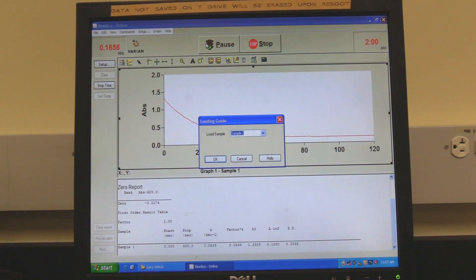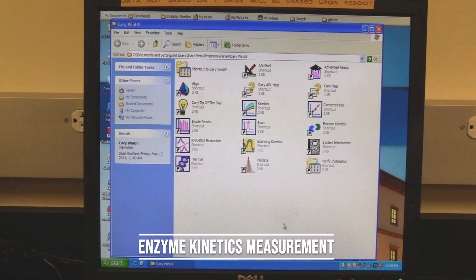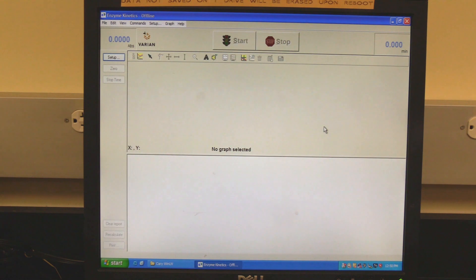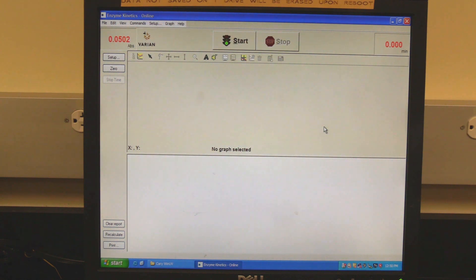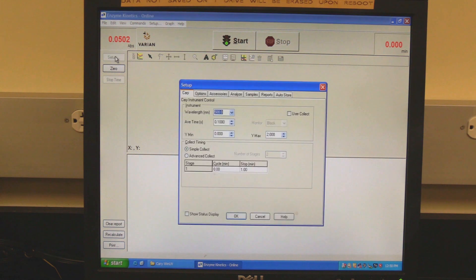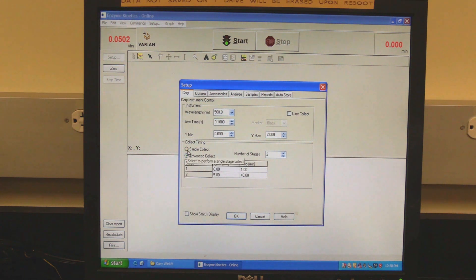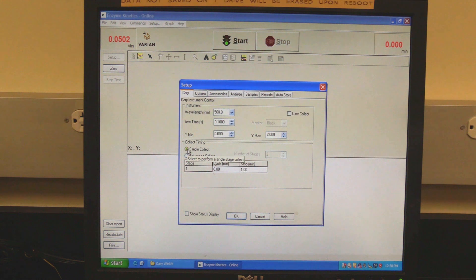The report area will have the calculated data. Enzyme kinetics measurement. In the Cary Win UV folder, double-click on the Enzyme Kinetics icon. Wait for the software to open and initialize. The instrument will be finished initializing when the absorbance reading turns red. Click on Setup to set measurement parameters. Setup should open to the Cary tab. In the Instruments section, set the wavelength and average time. In Collect Timing, select Simple or Advanced Collect. Use Simple if there is only one stage; use Advanced if there are multiple stages. In the Cycle column, set the cycle duration. In the Stop column, set the end time of the reaction stage.